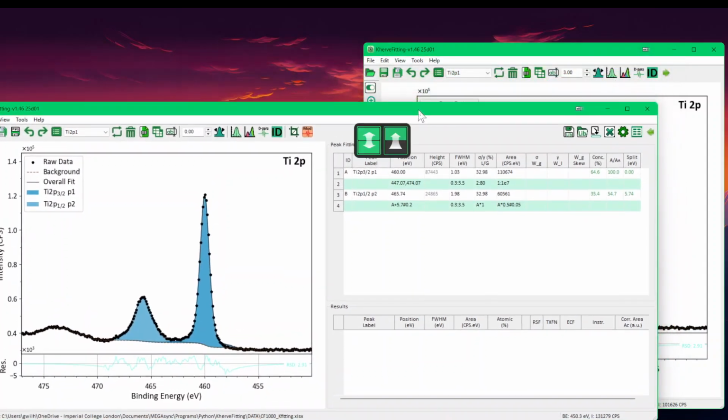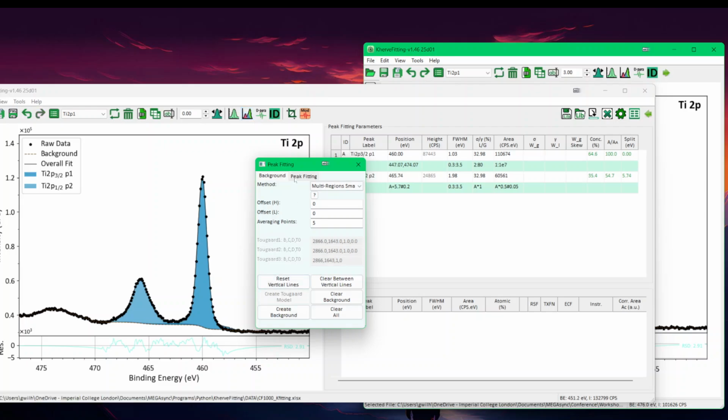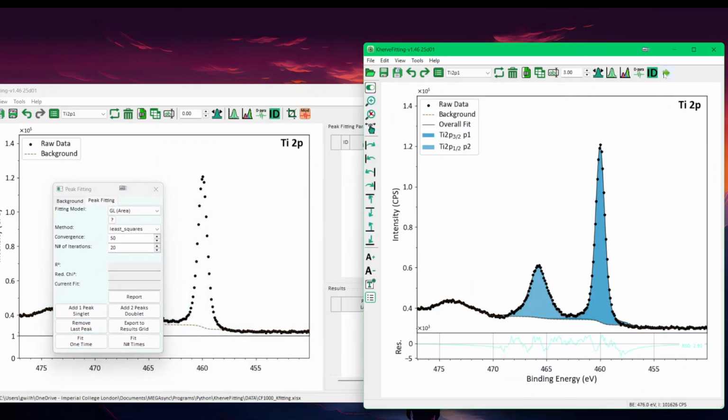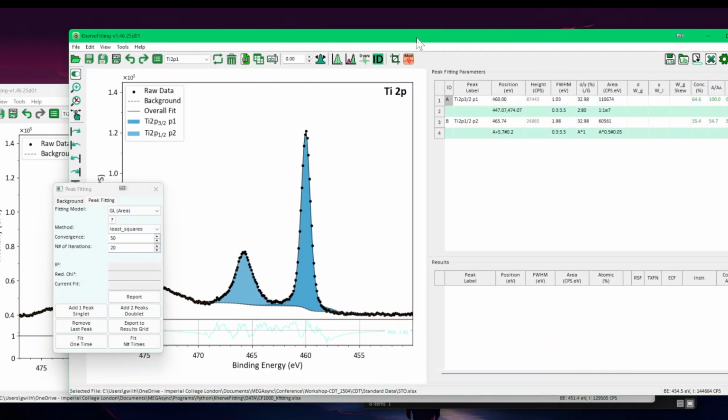Let's say now you had it completely fresh out of at least peak fitting peak models, and you want to copy this peak table. Let me just do that.